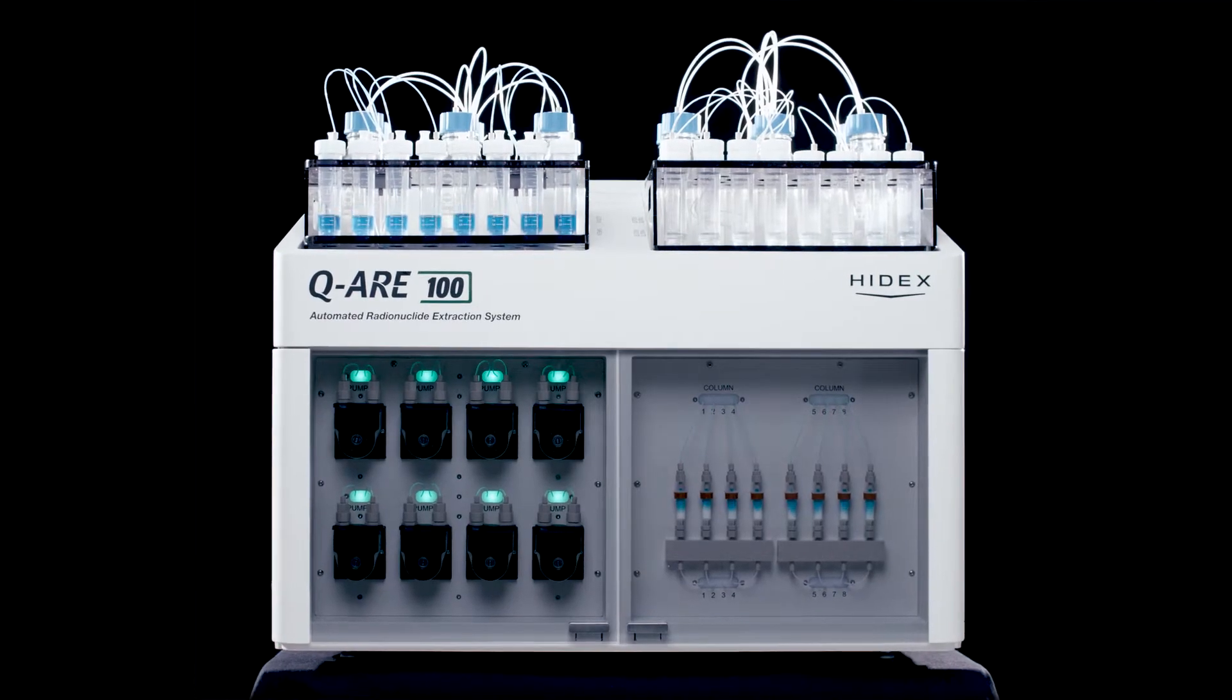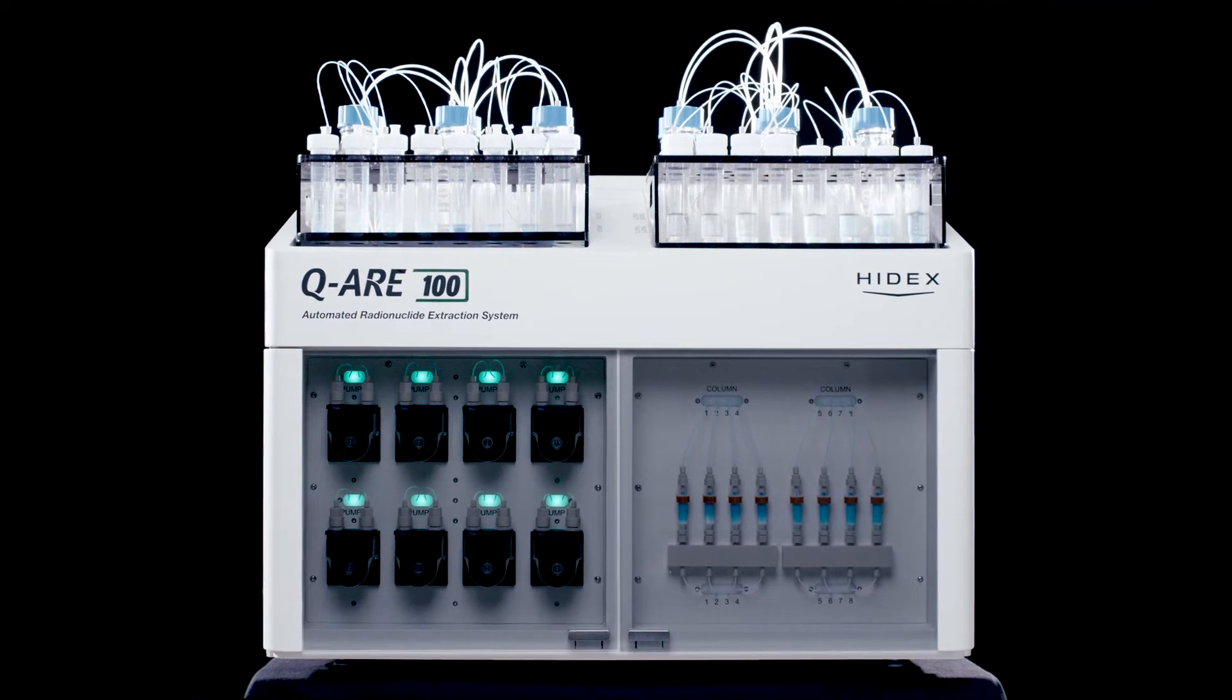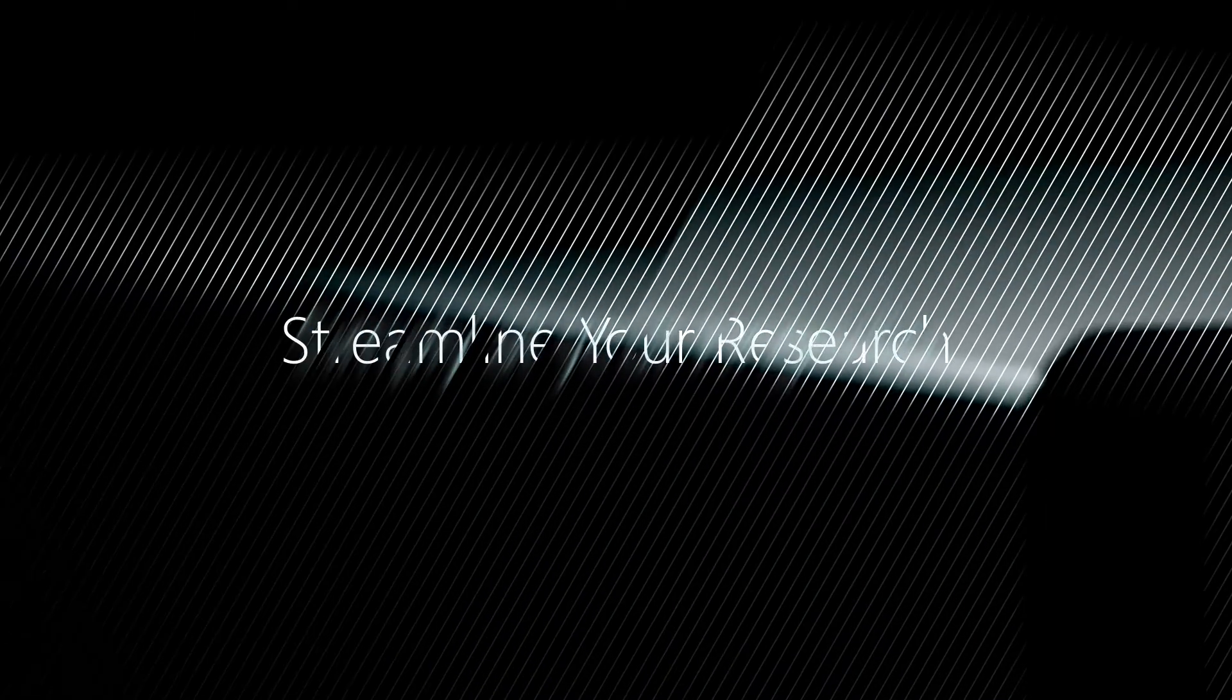Automate your radionuclide extractions with HIDEX QR100 and streamline your research.